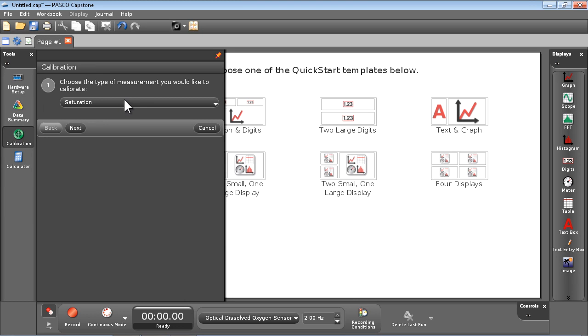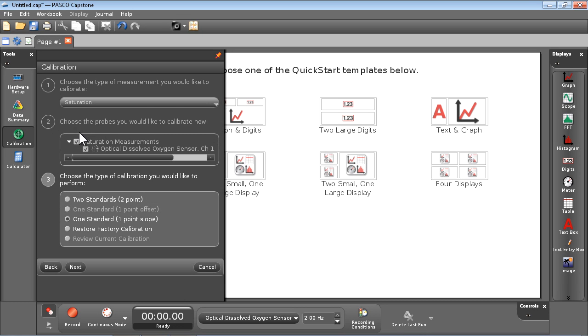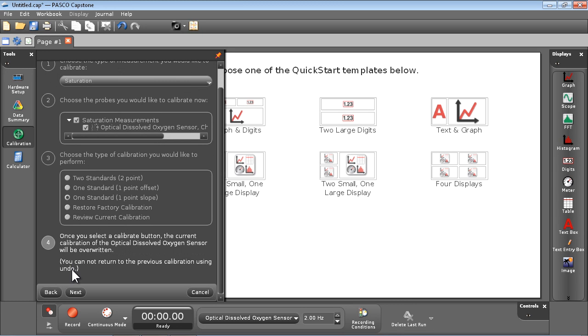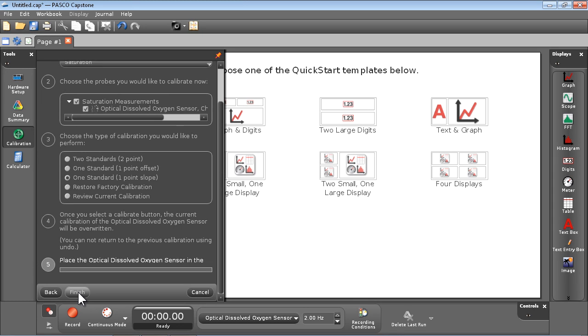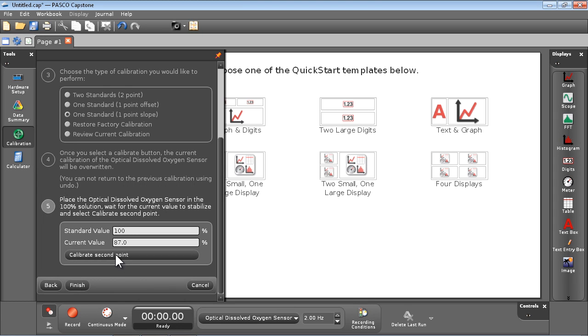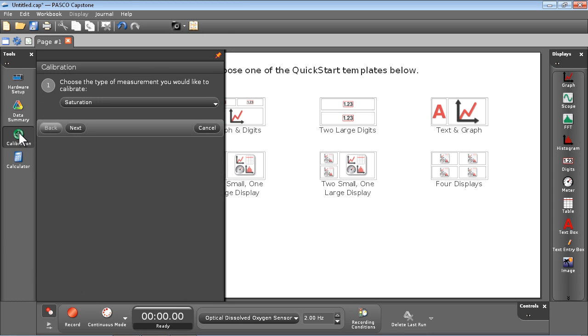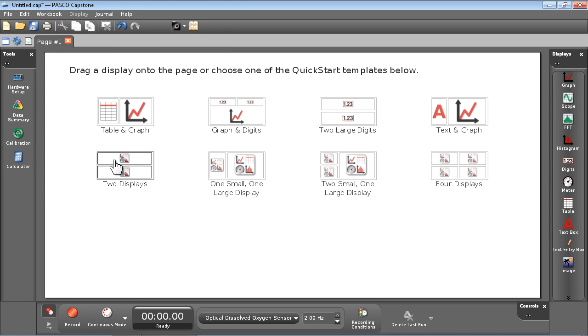Make sure the Saturation Measurement is selected. Proceed with the default one standard one point slope calibration. Acknowledge the warning that this will overwrite the existing calibration in the sensor. And wait for the current value to stabilize. Once this is stable, select Calibrate Second Point and then Finish. The sensor is now calibrated and we can proceed with the experiment.